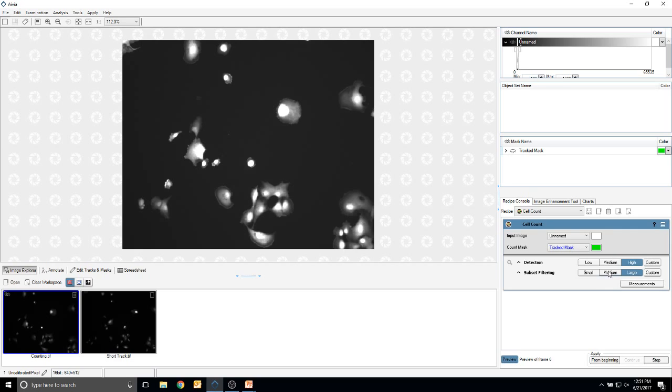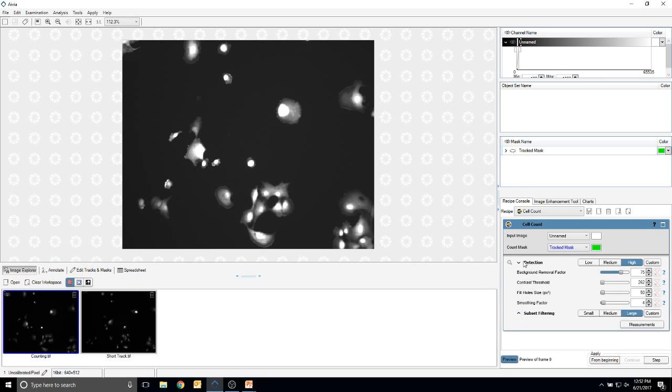We'll turn on the preview, and you can see this mask is a green, in this case, semi-transparent overlay that shows us the visual results of our process. This preview will be an important part. We also have individual previews for the separate preset groups.